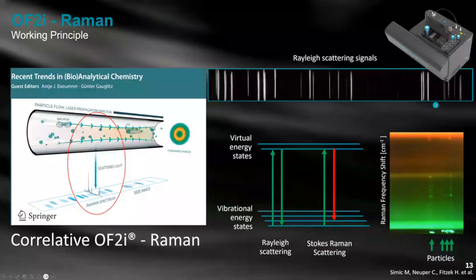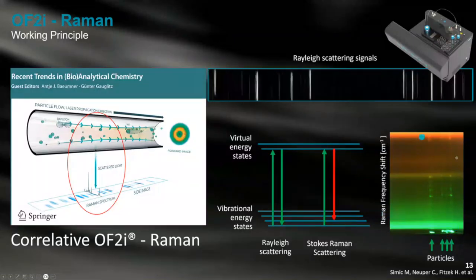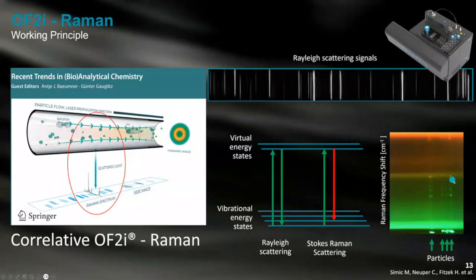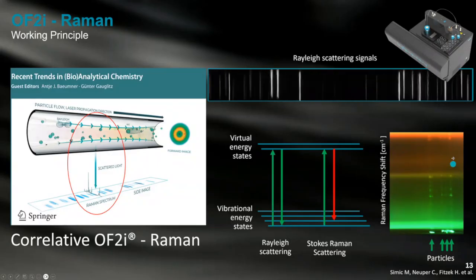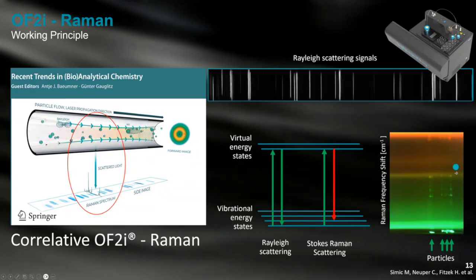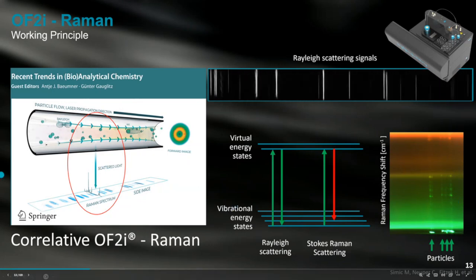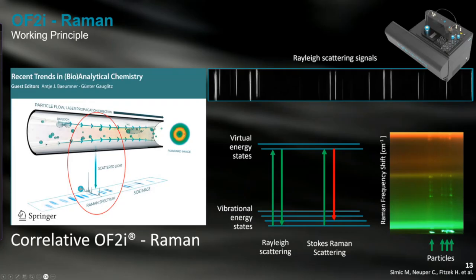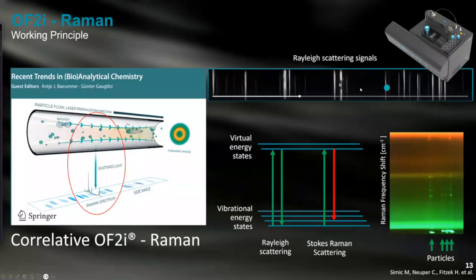And this Raman shift gives, for each particle, one of our first signals actually that we show here, along the frequency on certain signals. Here you can see already some brighter and some lower peaks or information on our camera. It gives an indication, yes, there are different intensities or different peaks coming from this shift. And with this Stokes-Raman shift, we now have the possibility to get information on single particles and create this Raman spectrum as a continuous working Raman flow-through tracer.